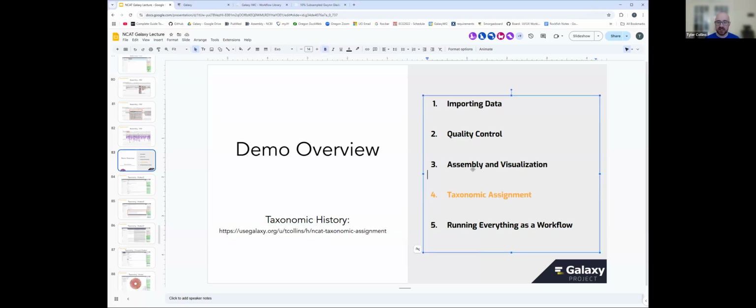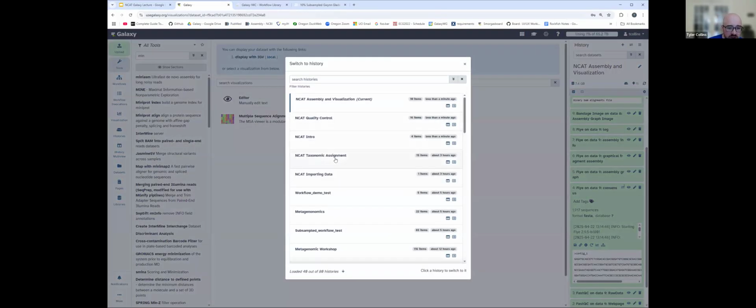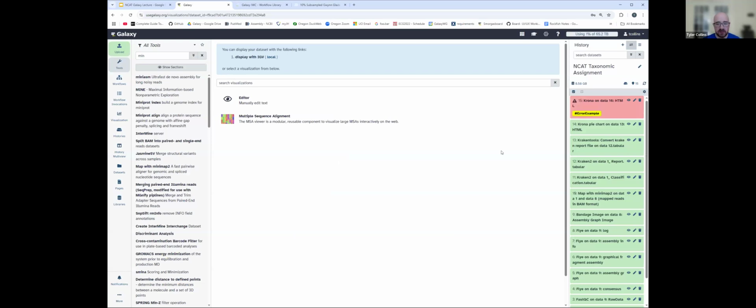The goal of this step is we skipped ahead a little, skipping some of the more quality control and trying to build metagenome assembled genomes and doing some annotation. Instead, we're going to look at, from our reads and from our contigs, can we try and assign those to a specific known species that exists in the world? Can we get some idea of what's present, the makeup of bacteria, what eukaryotic DNA is there, what's happening? So we'll hop on over to our taxonomic assignment.